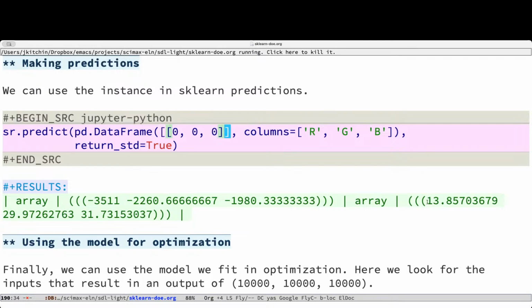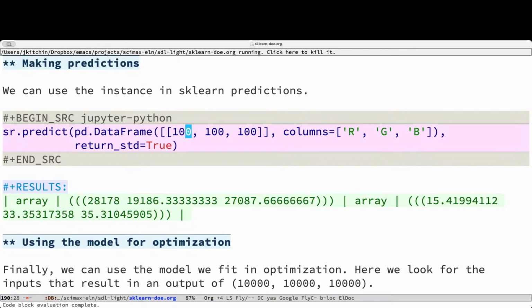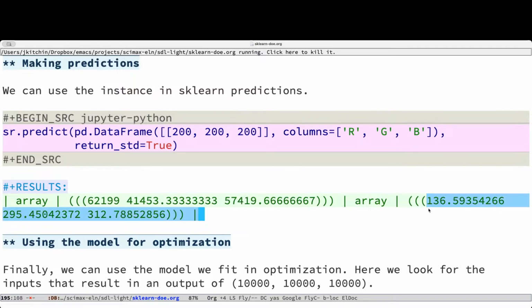But it's also a little bit overconfident here, and this could reflect limitations of the measurement. Let's try 100. So even if we go outside to 100 or 200, then you see these uncertainties start to grow and are much bigger than the MAEs that we've seen, and that ought to be an indication that this is not a reliable measurement.